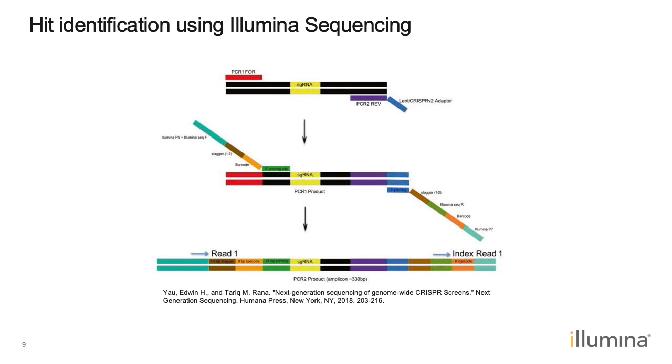So we are really going to take full advantage of the viral vector backbone sequence here that's flanking those guides to make our lives much easier when it comes to primer design. Now, in this paper from the Rana lab at UCSD, they designed a set of PCR primers able to effectively amplify the constant lentiviral integration sequence flanking the guide RNAs from the GeCKO v2 library. But theoretically, their method could be adapted to other libraries as well with a few minor tweaks in primer sequences.